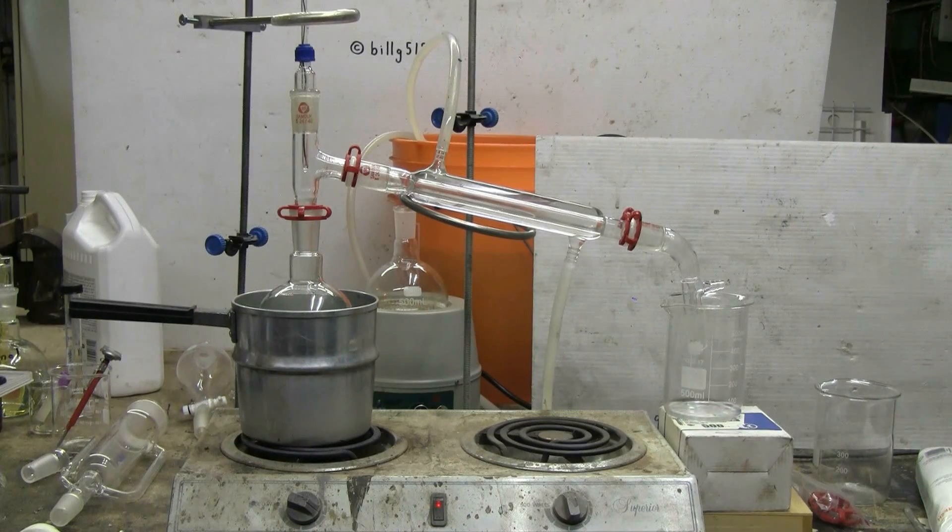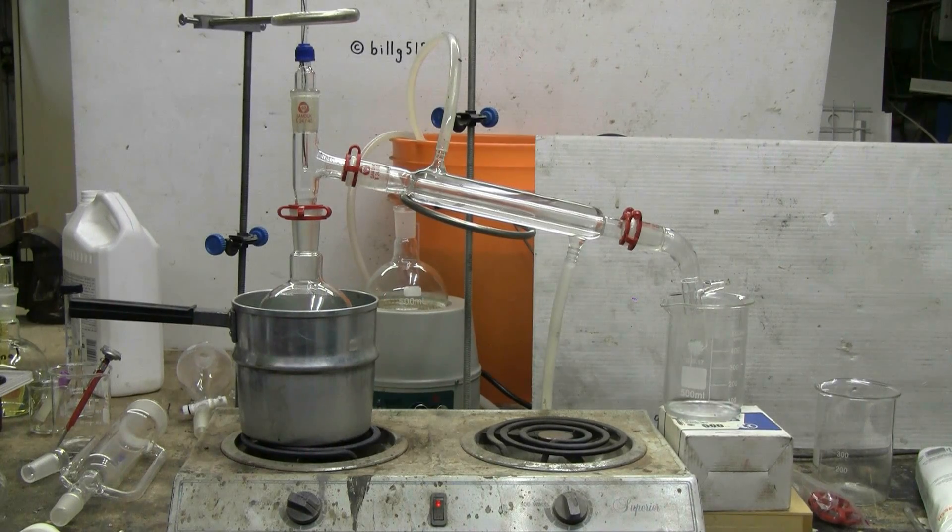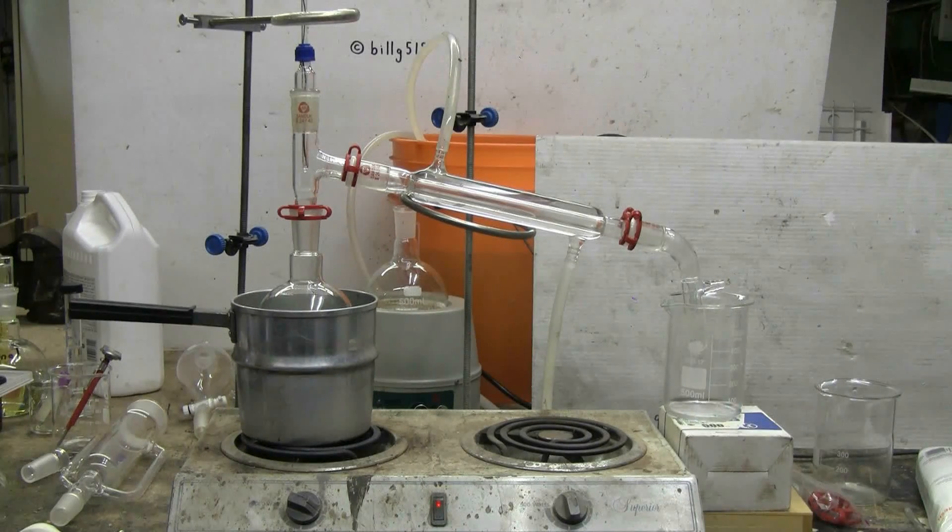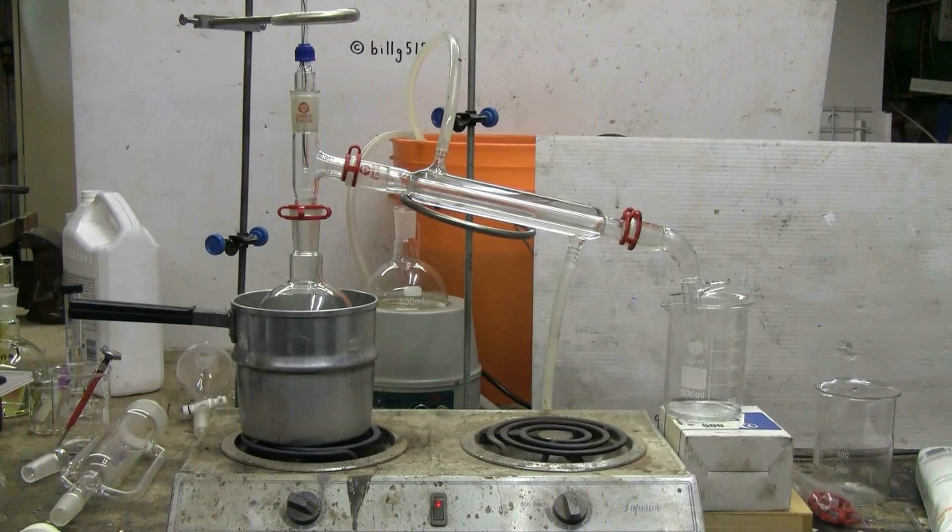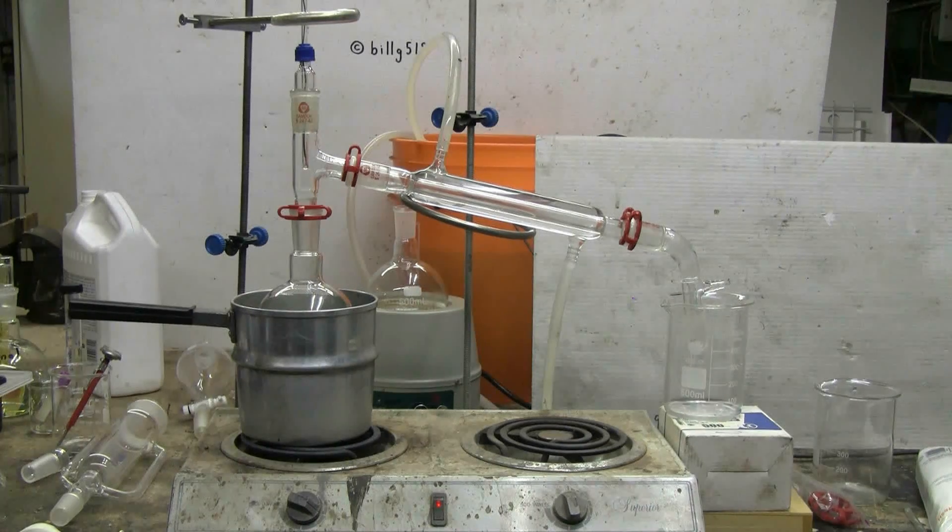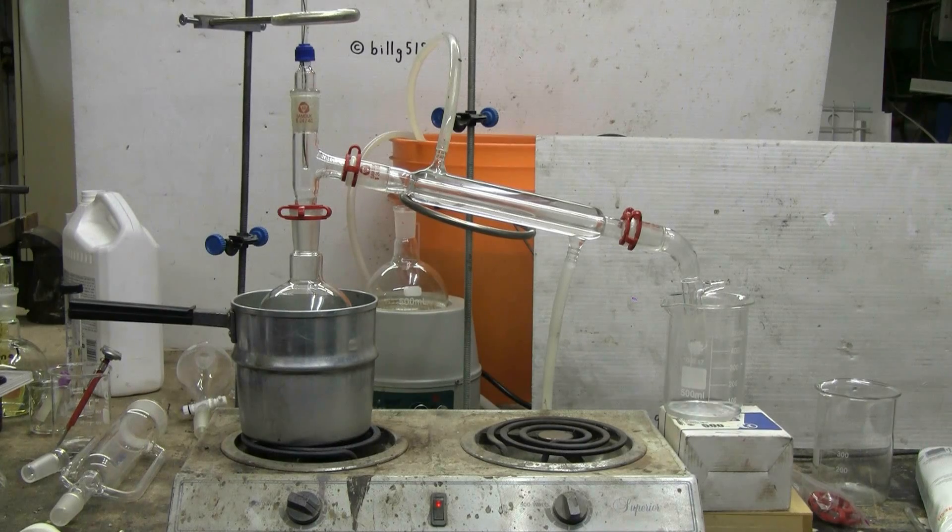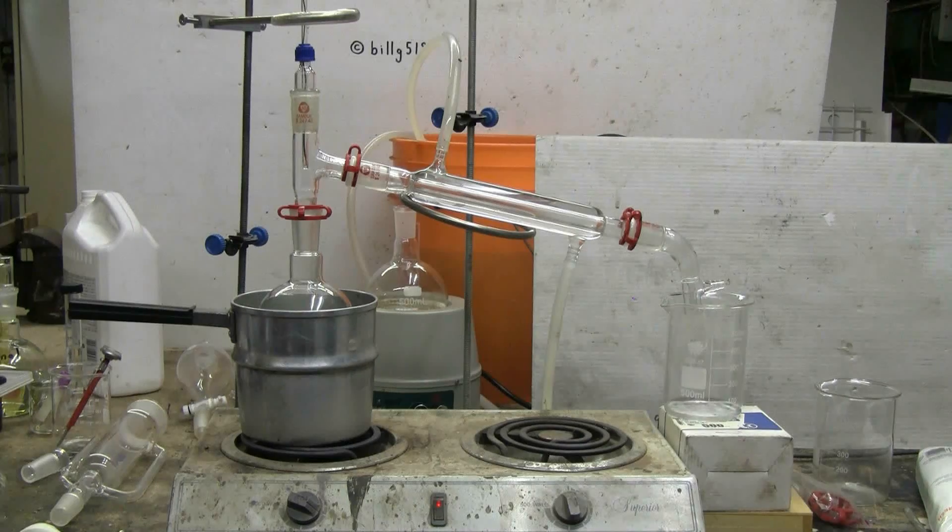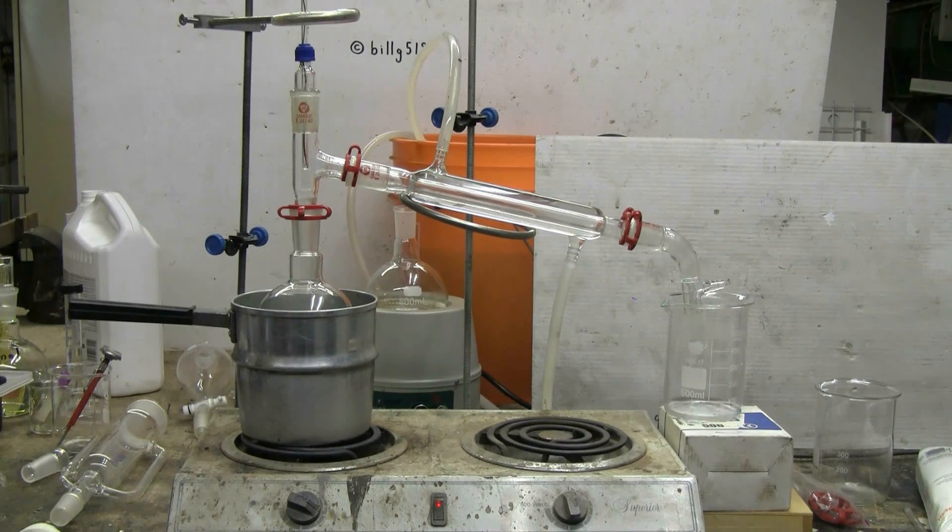I've switched over from the Soxhlet apparatus and set up here for simple distillation to recover my diethyl ether into the 500 milliliter beaker on the right. The same boiling flask that was attached to the Soxhlet apparatus and contains my ether and my extract, if any, from the peony flowers is attached to the distillation rig, of course.